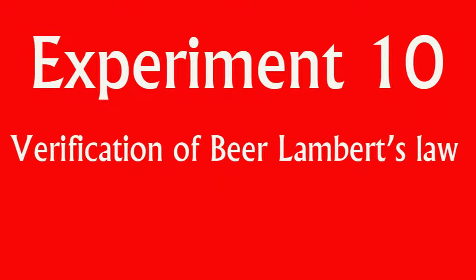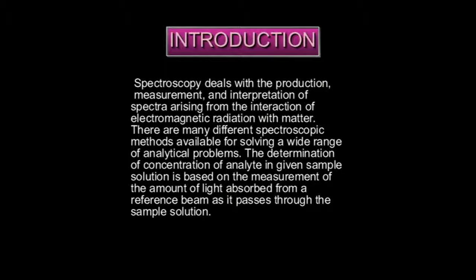Experiment 10. Verification of Beer-Lambert's law. Spectroscopy deals with the production, measurement and interpretation of spectra arising from the interaction of electromagnetic radiation with matter.